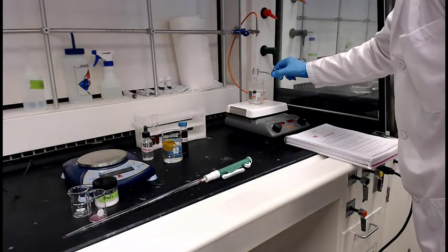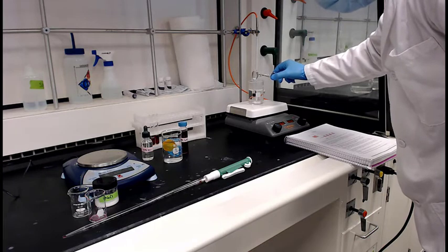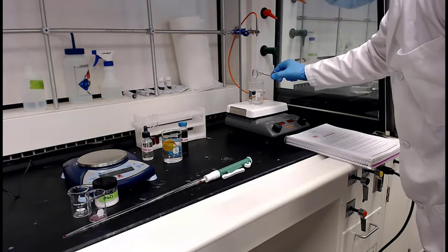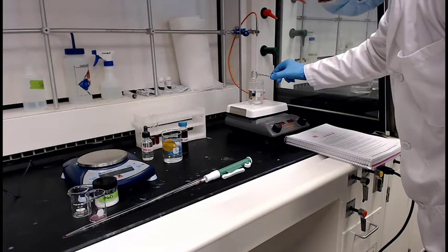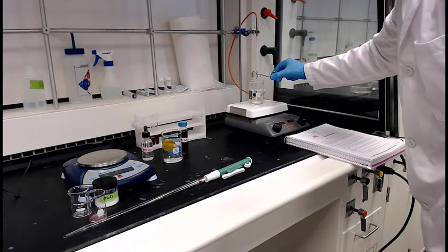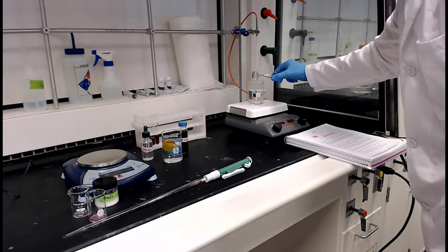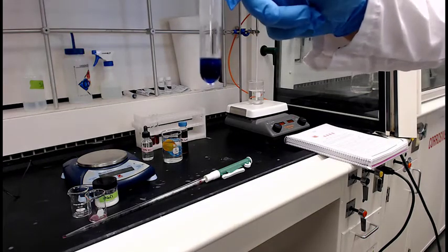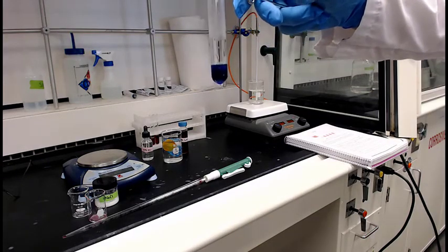Now he's going to go into the hot bath and see what happens. This is going to be real instructive. Looks like when he's going cold, it's pushing it back to purple. Now he's going to get it nice and hot, adding heat. And looky there. Oh, that pushes it strong to the blue side.